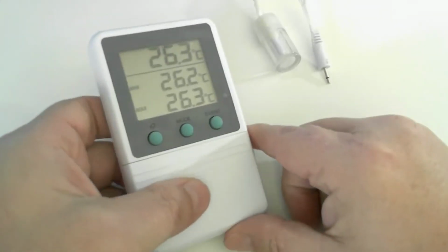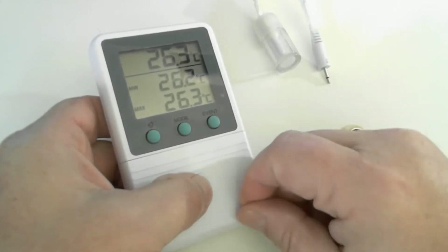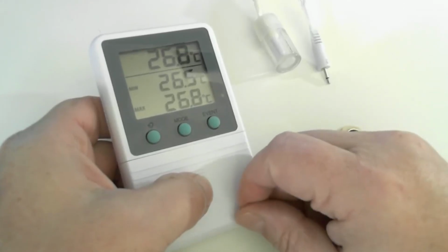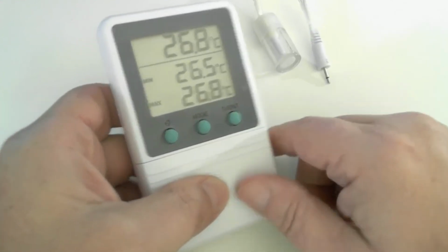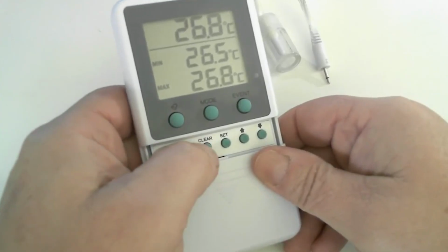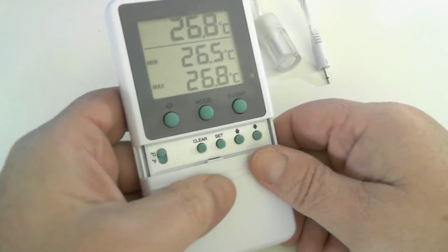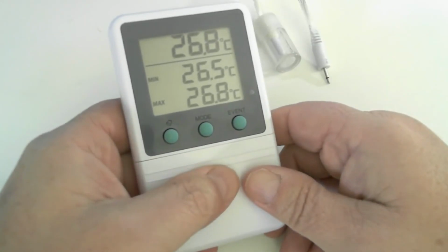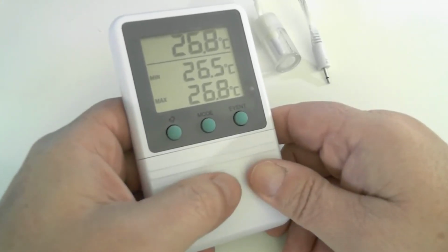unplug your probe, put it into your fridge, freezer, or other device, and let it be in that environment for at least 30 minutes so it conditions the buffer medium for that temperature. Once it has been in there for 30 minutes, you can bring your unit back over, plug the probe back in, and hit the clear button, and that will remove all the time and date stamp recordings, and you'll be now ready. It should be in no alarm condition, and you should be able to start monitoring from that point forward. That concludes our instructional video for the ACC821.